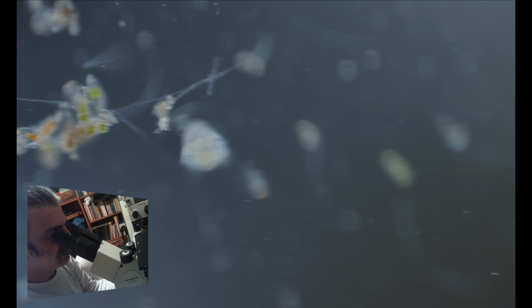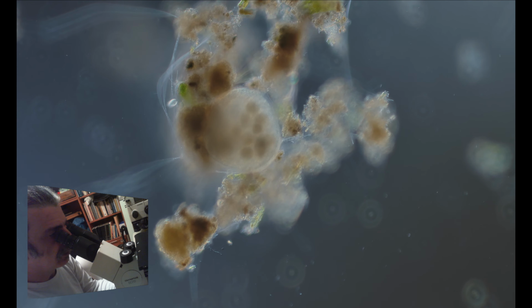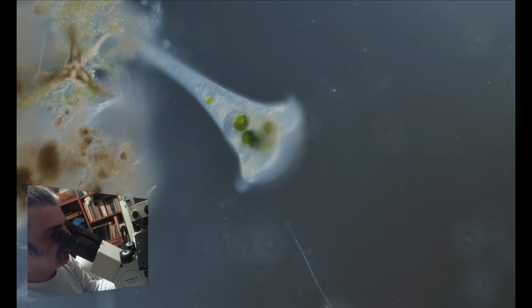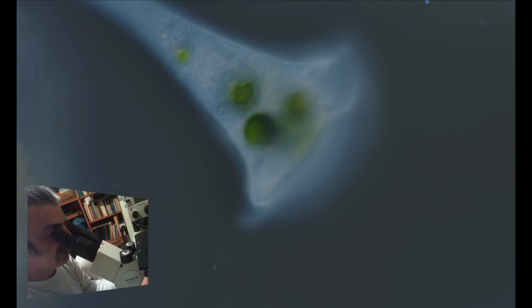And who else do we got here? There is a Trachelius hidden here inside the debris. Hydra, and this is a very nice Stentor. All those green blobs that you see inside are actually food particles. Let's see it in more detail. I have to adjust the color ring of the lens.